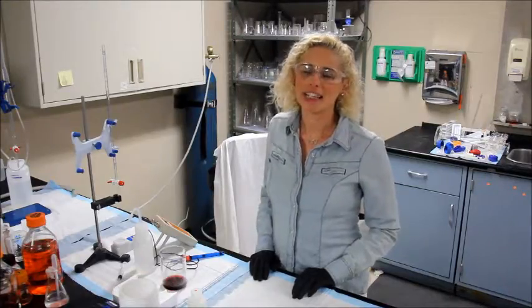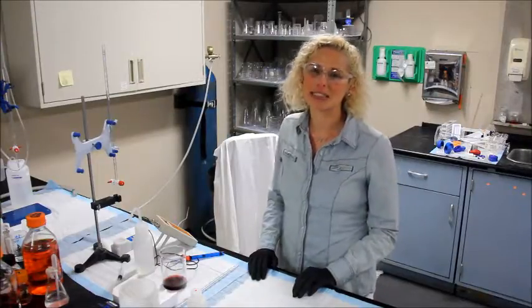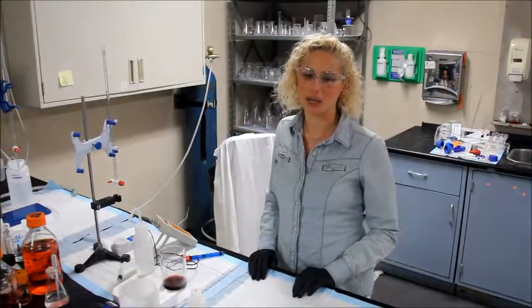I'm Rachel from Vimitrica and I'm here to show you our new YAN test kit which measures yeast assimilable nitrogen in your wine.